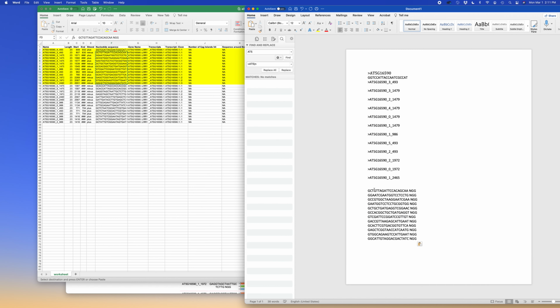Keep text. And then just put it up here. Like that. Cut and paste. Cut and paste.